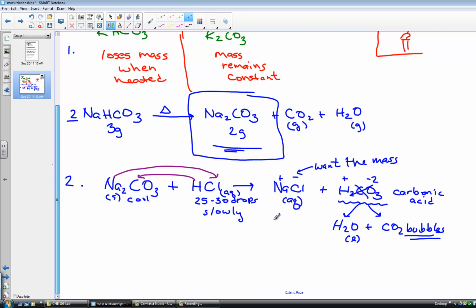So initially, I know the mass of my initial reactant. I know the mass after the first set of heating. It may or may not change. The next recording is the mass at the final end, and it's now a chloride salt. Might be potassium chloride, might be sodium chloride. And those really are the measurements that we need to go on and actually form a conclusion of what the unknown was. We're going to do that by a concept called mass percentage.